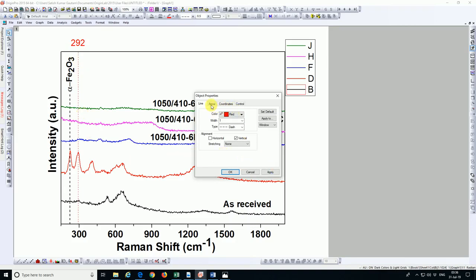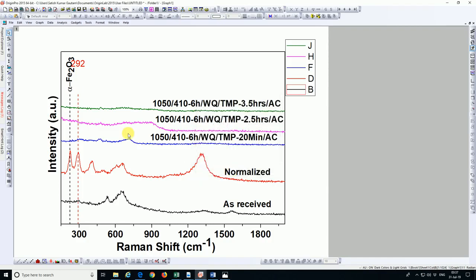Now go to the arrow. If you want to put an arrow on any side, lower side, bottom side or top side, you can change it from here, begin and end shape. And now I want to go to the coordinate because I don't want to put any arrow. I want to take it to 6800 as I have taken earlier. Okay, I want to delete it.